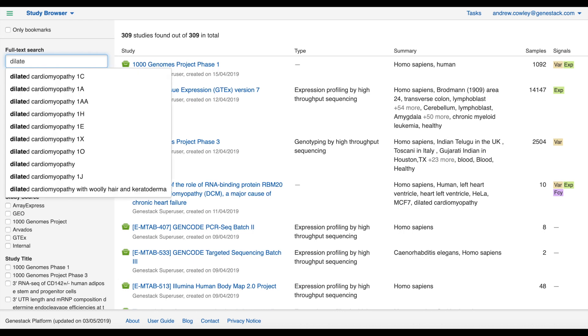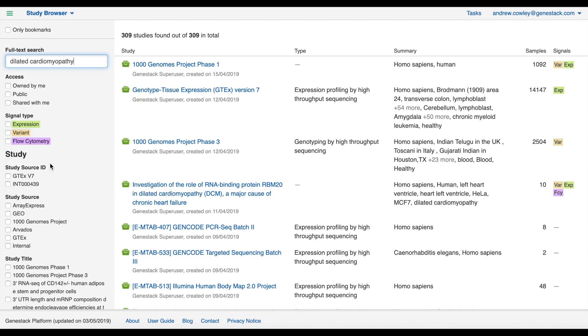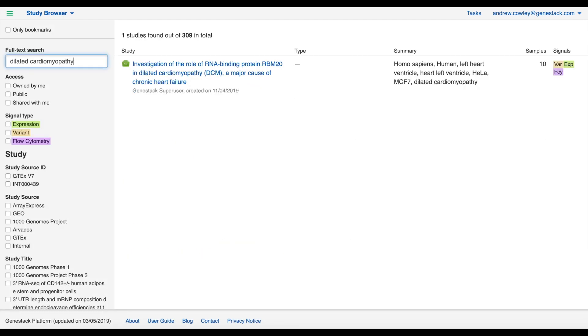As I begin typing you can see that I'm offered autocomplete suggestions based on the dictionaries of the terms that are present in ODM. So if I now select dilated cardiomyopathy and press enter, my search is carried out and the results reflect this.